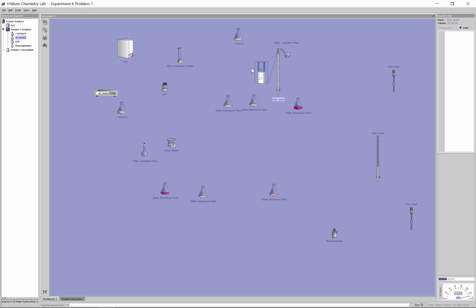Let's see what that brings us up to. So between 4 and 5, good. So I have about 40-ish mils in there. I can reload between trials, no problem. I need to take down that starting reading, and I'm ready to titrate against the second flask. So right now, my starting reading here, it's currently about 4.25. We knew the other one was about 33 milliliters, so I should be pretty safe just tossing in, I don't know, 28 milliliters, right? So that's why the rough estimate here will help you out.